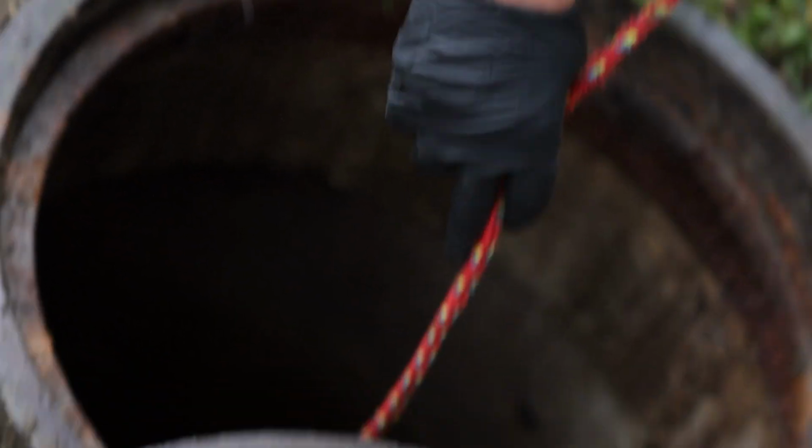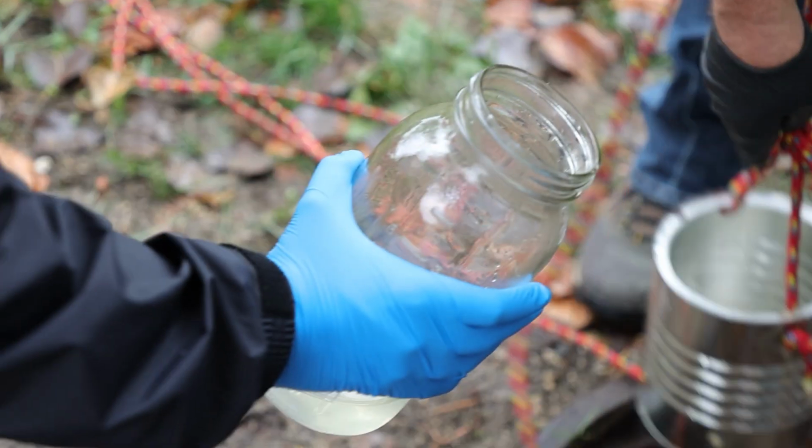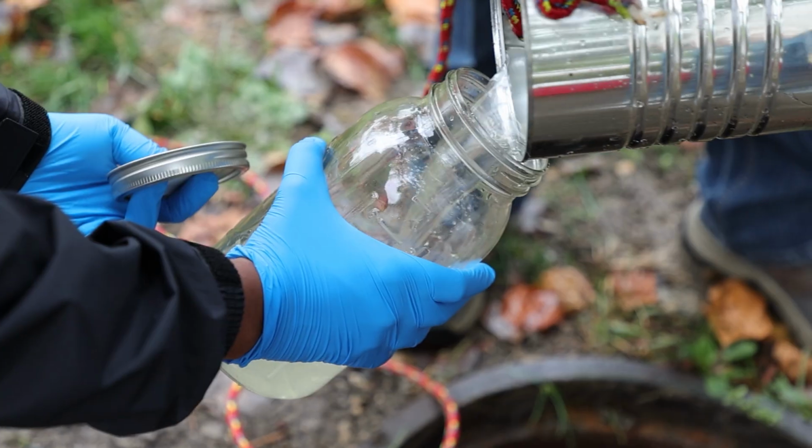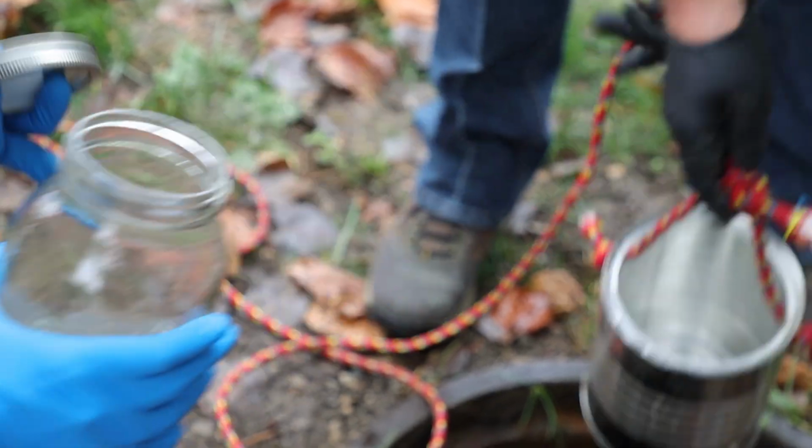So we went out as a class and we collected samples of water at different inflow lines around Muncie. And we took these samples and we processed them by filtering out the water and then collecting anything that was left behind. That could be organic matter, it could be microplastics, and then we tested for that.